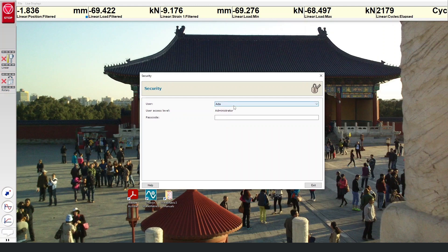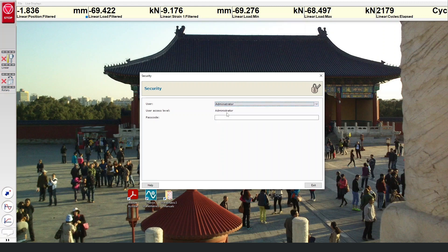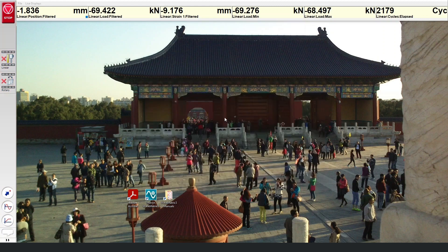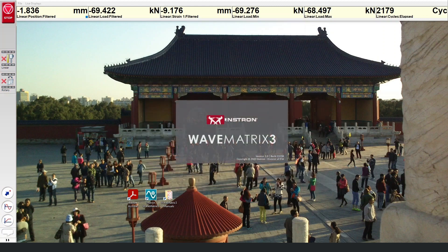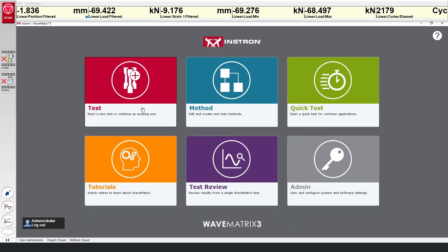Now, when opening Wavematrix 3, the user will be asked to select their profile and log in with their pin code. With full access for administrator and manager profiles, you will see the usual home screen, but with the additional button to change user.